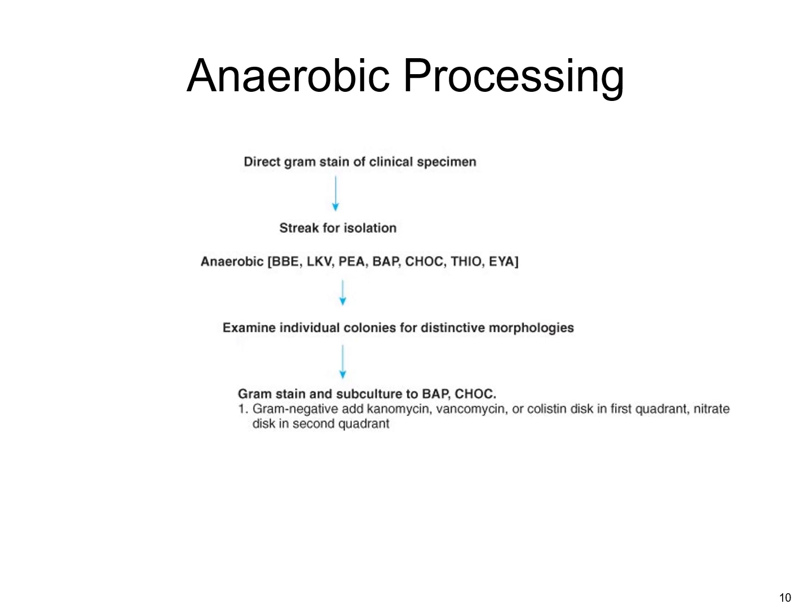You still wouldn't know whether it was aerobic or anaerobic at this point, but if you did see spores, that could lead you in one direction or the other as well, and it can help correlate with what you could potentially be seeing in that specimen.